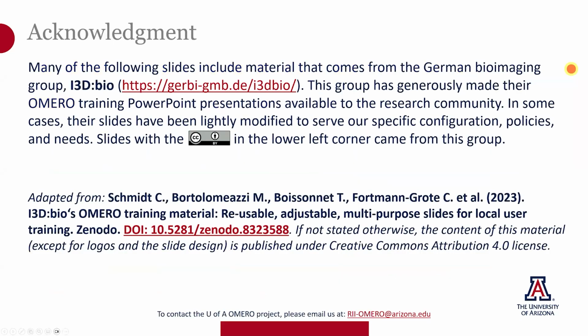Many of the following slides include materials that come from the German bioimaging group i3D Bio. And this group has generously made their training presentations available to the research community. In some cases, their slides have been lightly modified to serve our specific configurations, policies, and other needs. And if you see slides with the Creative Commons logo down in the lower left corner, those came from this group. And here's the appropriate acknowledgement.